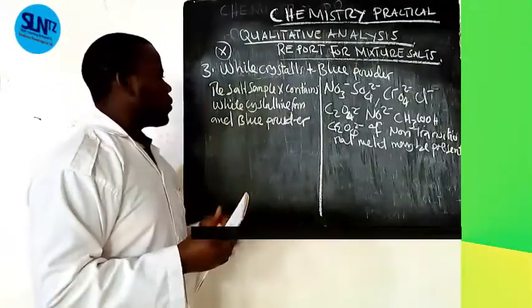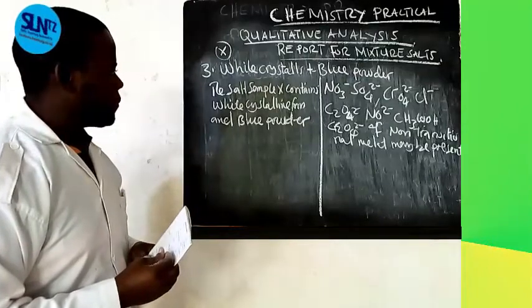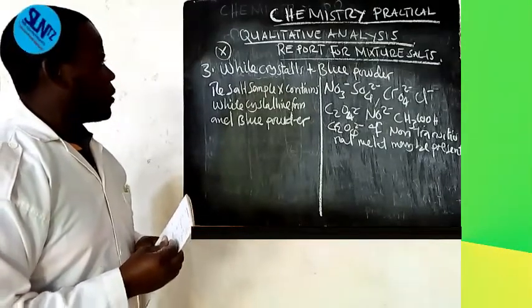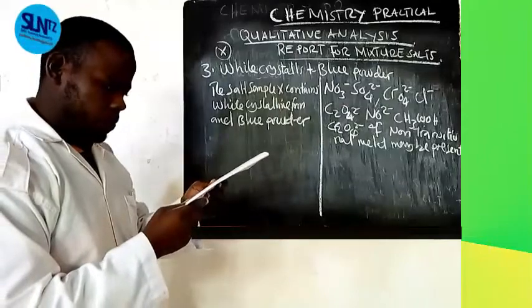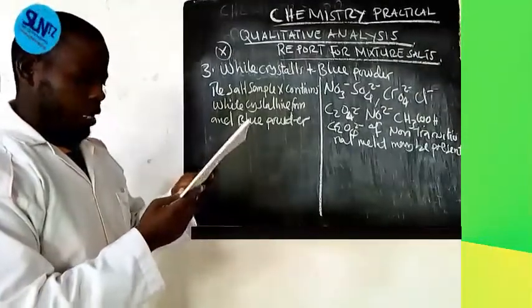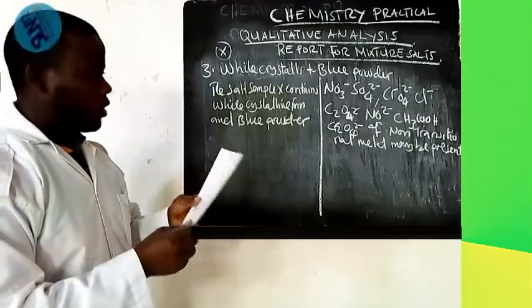But also blue powder. When you come in case of blue, there is copper and cobalt.